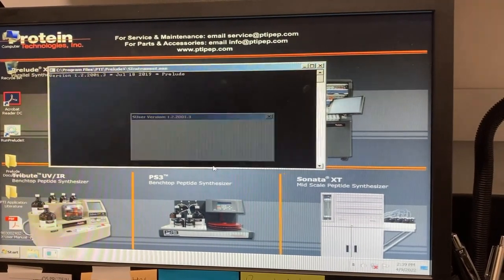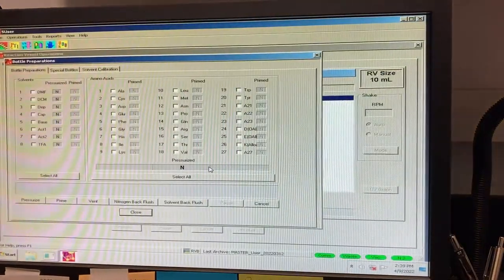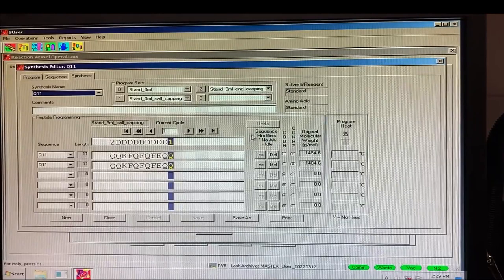Once you are satisfied with the sequence, you can go to the Synthesis tab. In the top left corner of the window, you can select the synthesis file you want to use. In this example, we are using the Q11 synthesis file.